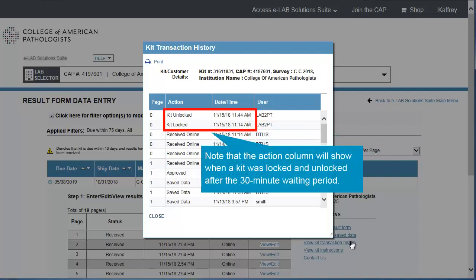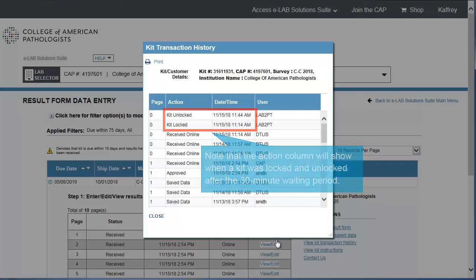Note that the Action column will show when a kit was locked and unlocked after the 30-minute waiting period.